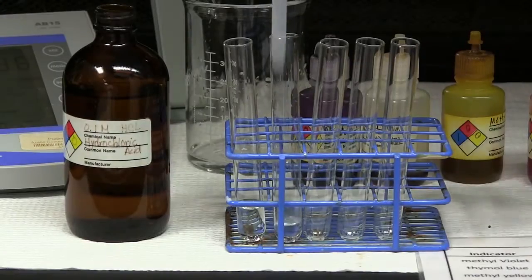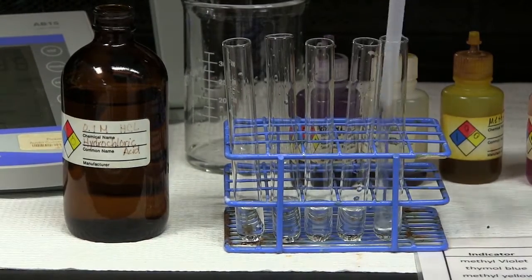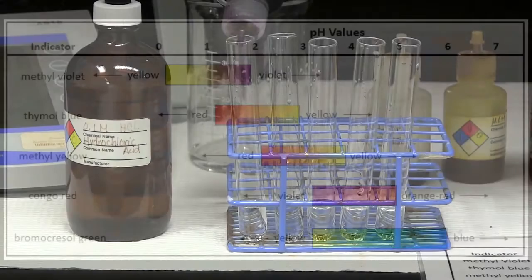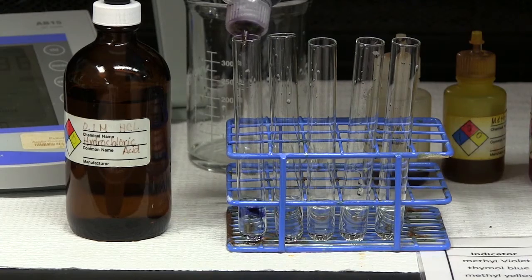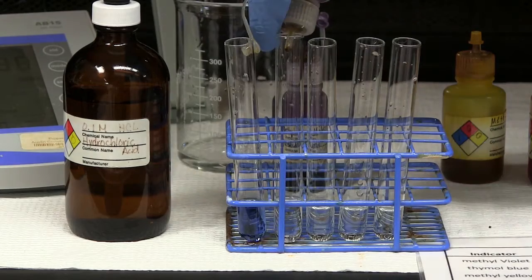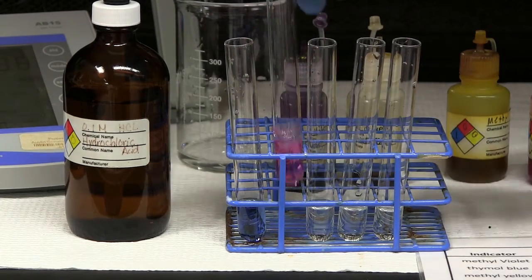To each of 5 small test tubes, add about 1 milliliter of 0.1 molar hydrochloric acid. To each tube, add a drop or two of one of the indicators listed in the following chart. Note the color of the solution you obtain in each case. By comparing the colors you observe with the information in the chart, estimate the pH of the solution to within a range of 1 pH unit.